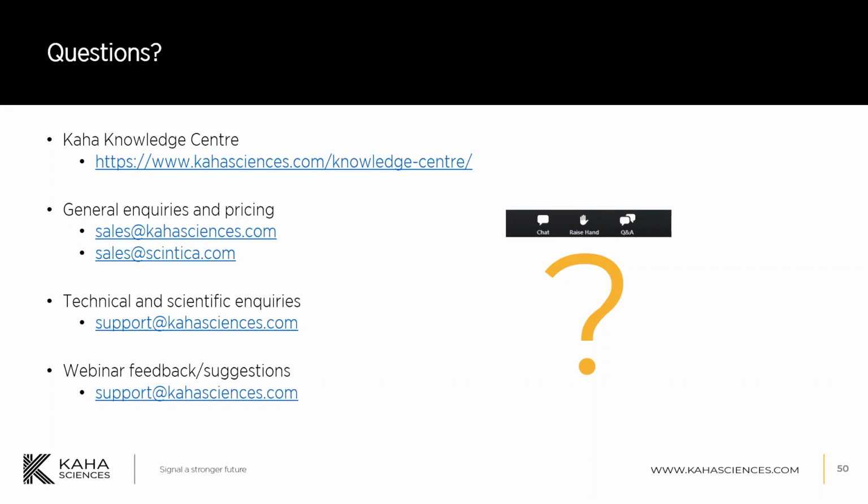Right, because one of the questions was in dogs, and I believe that's probably too large. Yeah, it would kind of defeat the purpose of the telemetry system because you couldn't recharge the telemeter. So you'd be limited to 3 to 6 hours, which would get you nowhere really. So no, it's not suitable for telemetry in dogs.